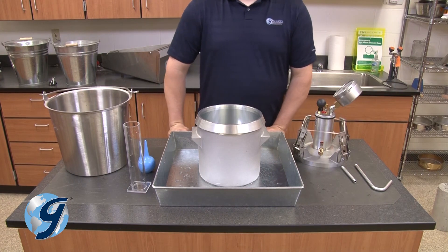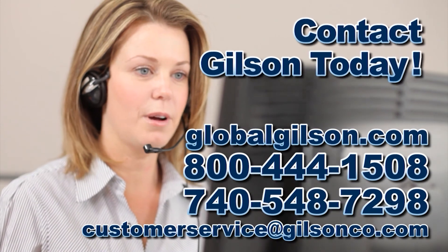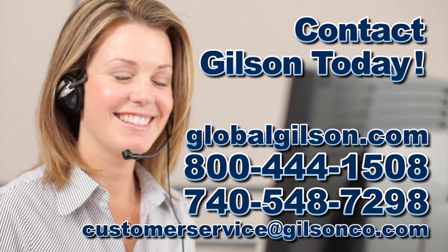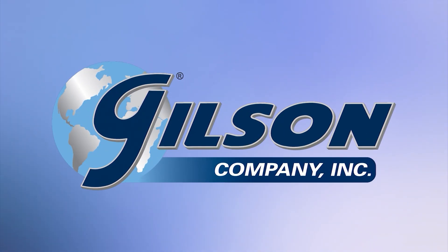Unclamp the lid assembly, remove the small calibration tube, and finally remove the water from within the base. For any questions about calibrating the HM-30 or for any Gilson product, please contact your Gilson Technical Support Team.